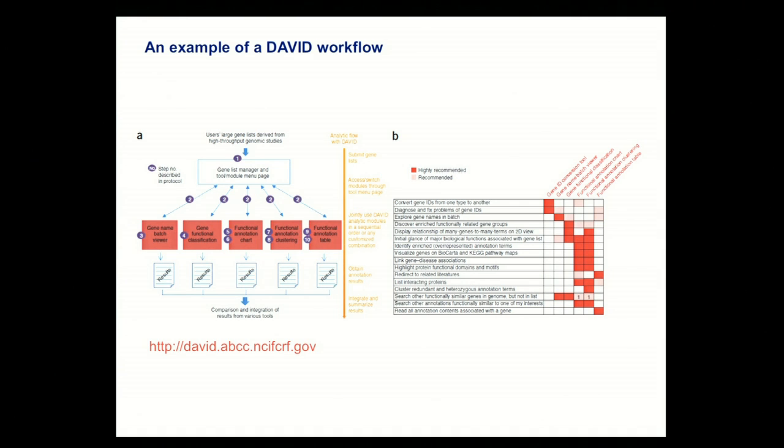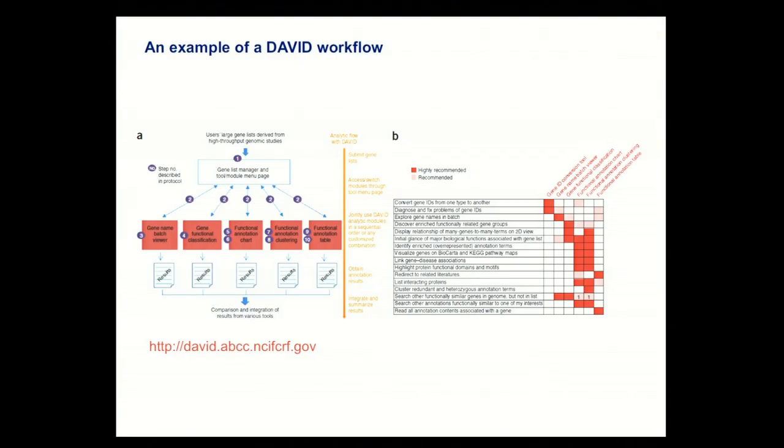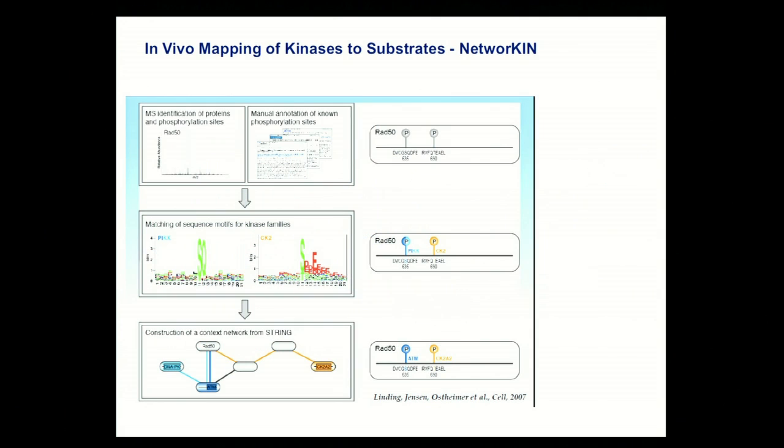And these give you gene ontology enrichment categories and so forth. This turns out to be a really flexible and nice tool for annotating proteomics data sets, and it's a really well-described resource too. If you think this is of interest to you, you should read the really nice Nature Protocols paper, and also the very thorough descriptions of this method on its website. It has also been vetted because it's extensively used in the proteomics community, I would say by the top proteomics groups.